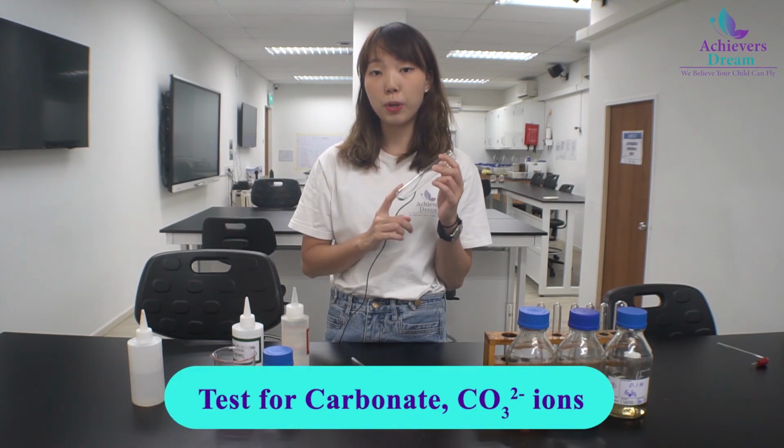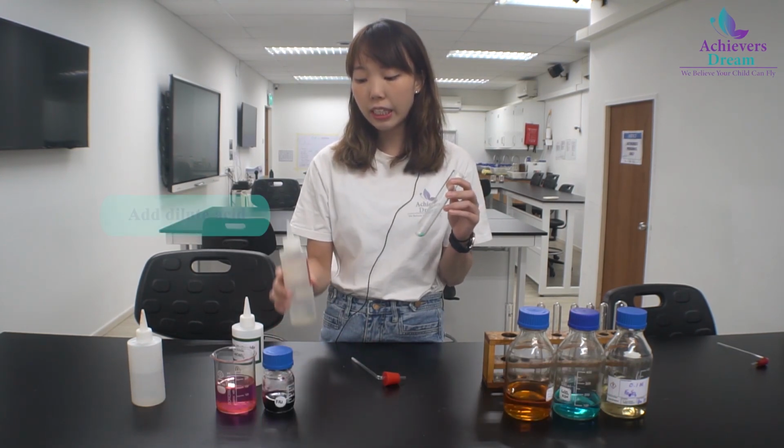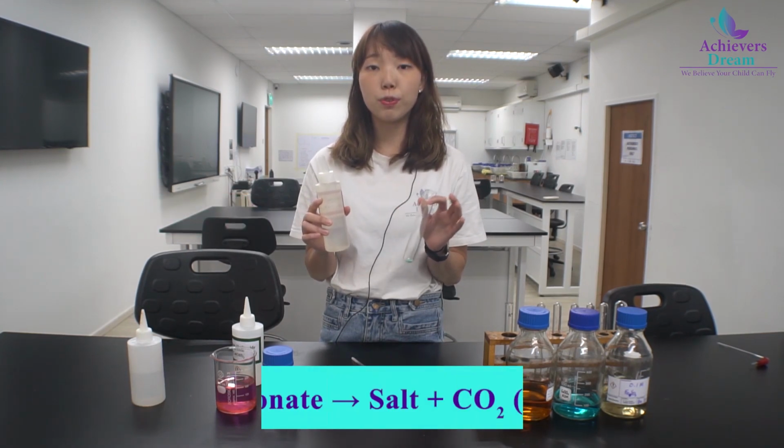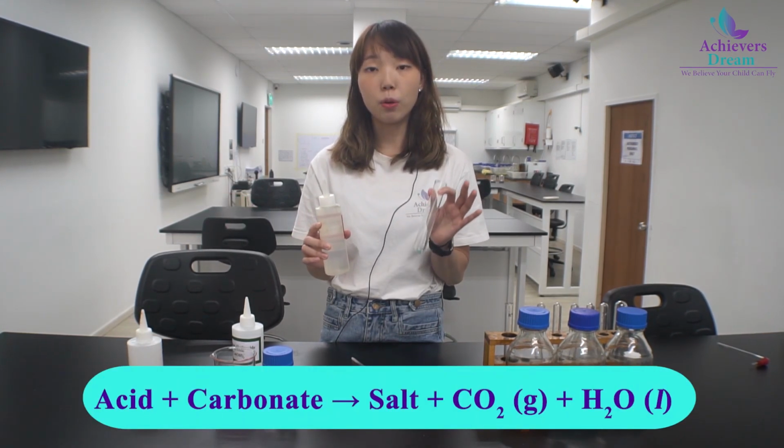On to the test for anions. First up, we'll be testing for the presence of carbonate. I'll be adding in an acid. This is your acid-carbonate reaction, which will give you a salt, carbon dioxide, and water.